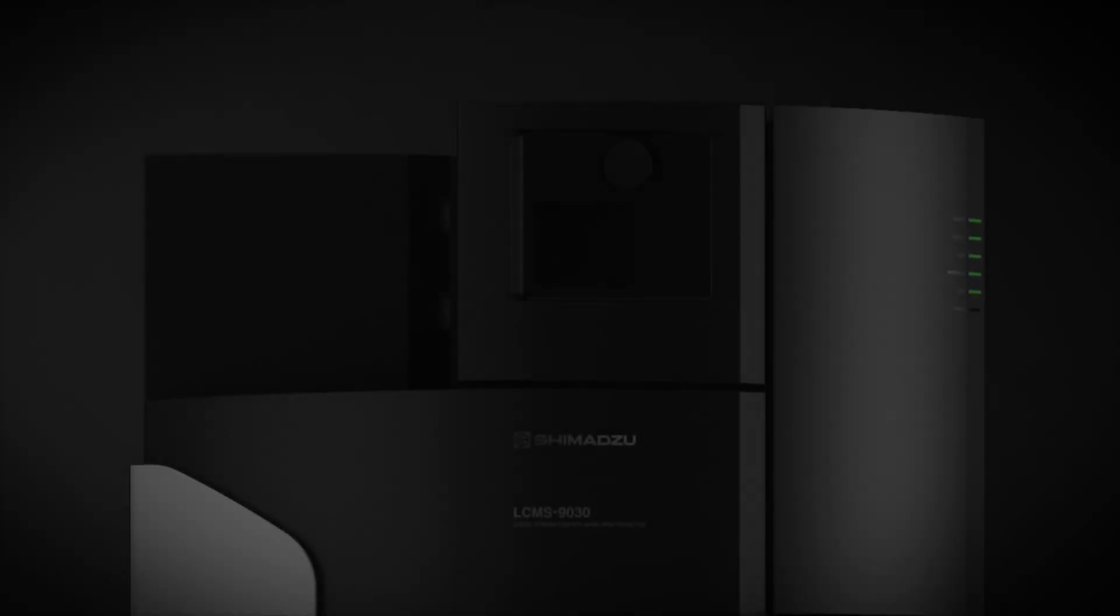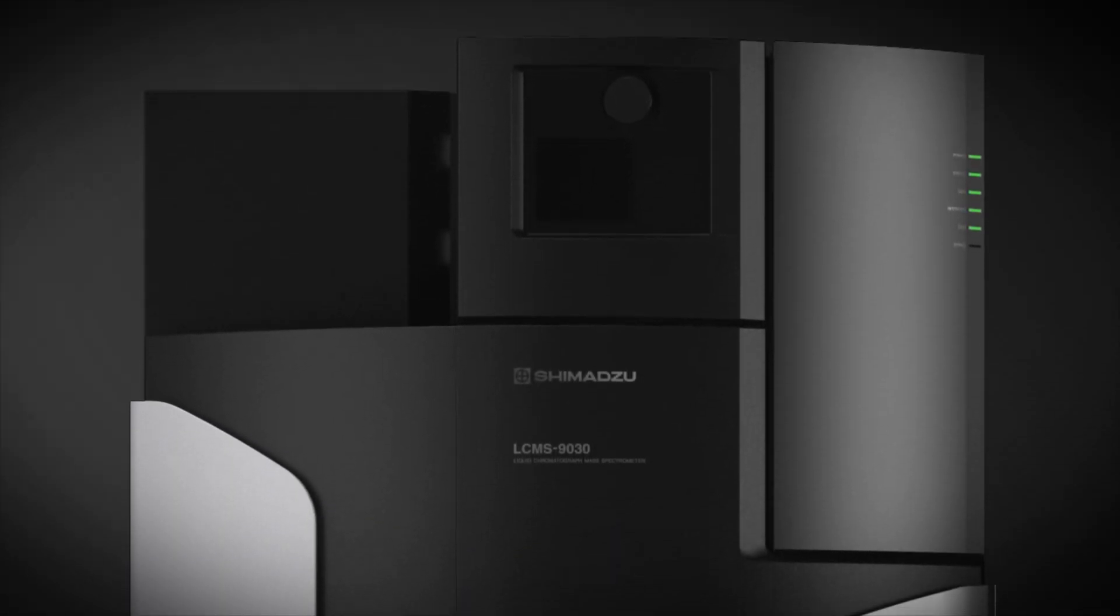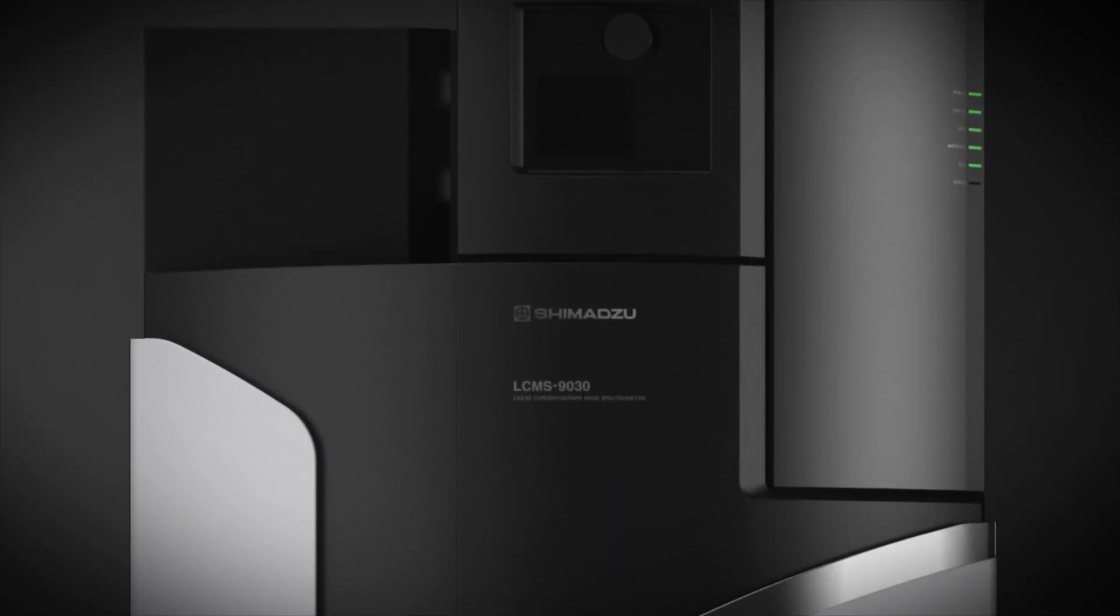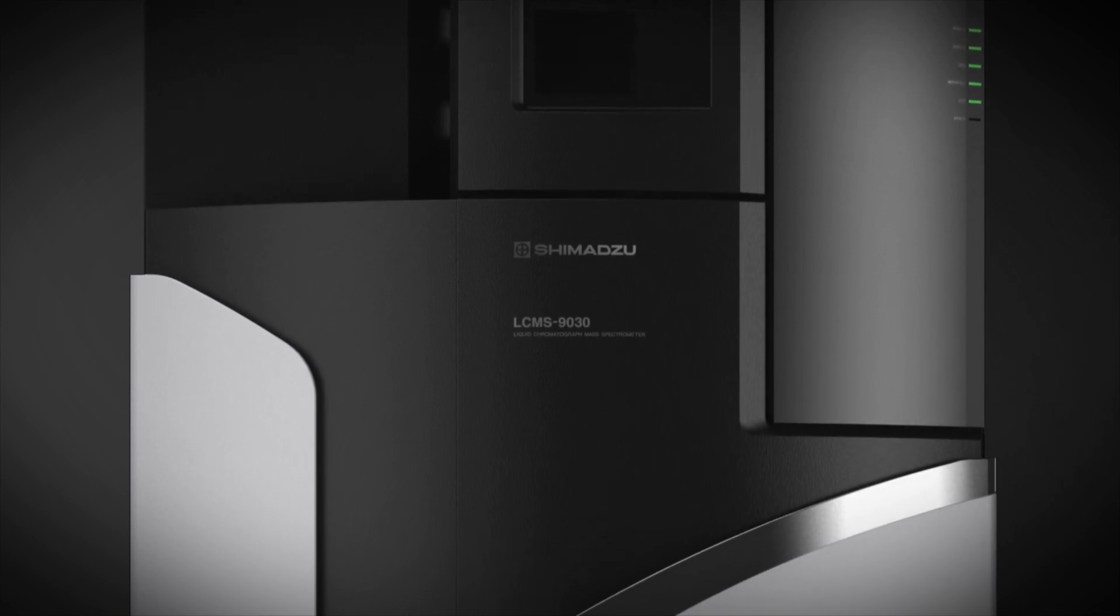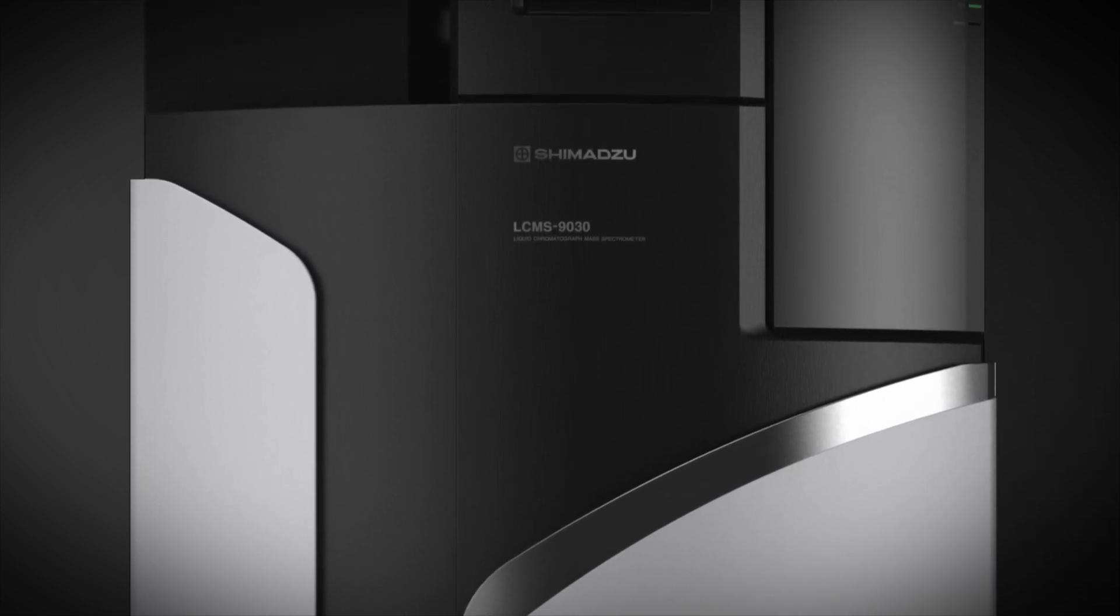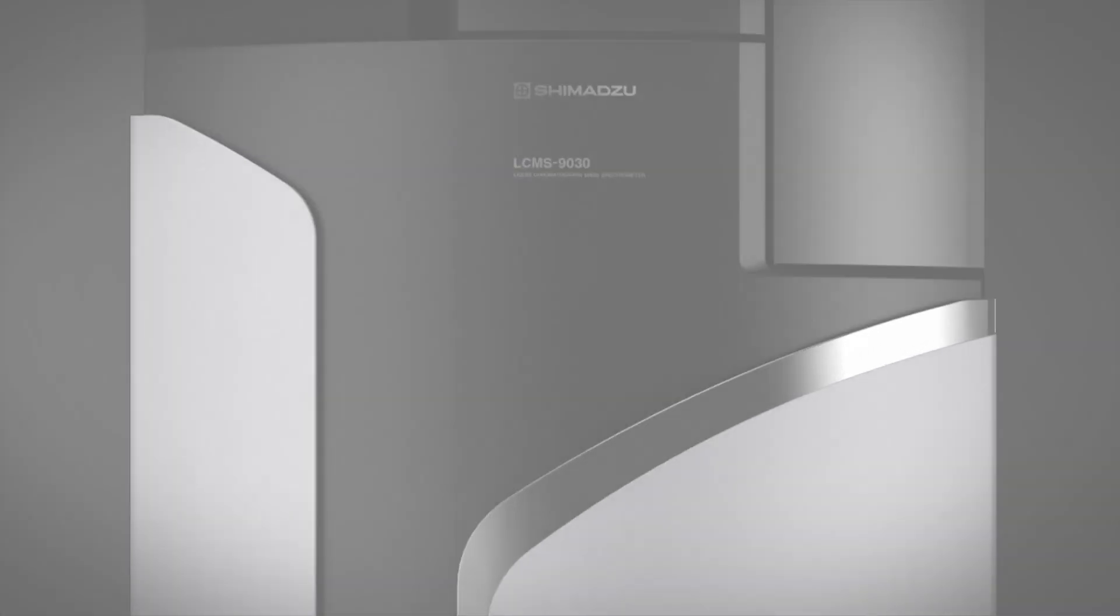These innovative technologies enable the LC-MS 9030 to bring important concepts to reality. This is Effortless Performance.